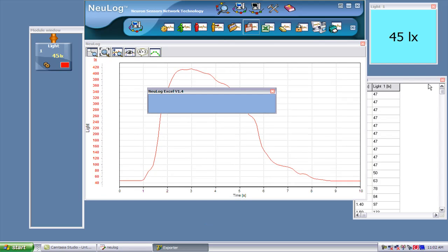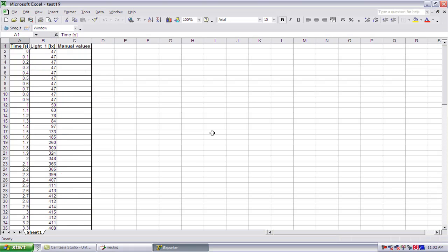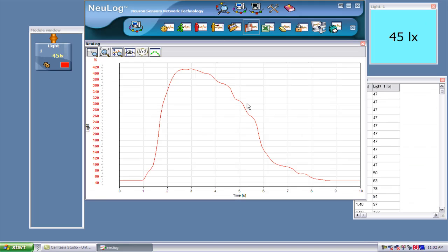So we're exporting the data to Excel. And there we are. We've got our data. We can do analysis on that now.